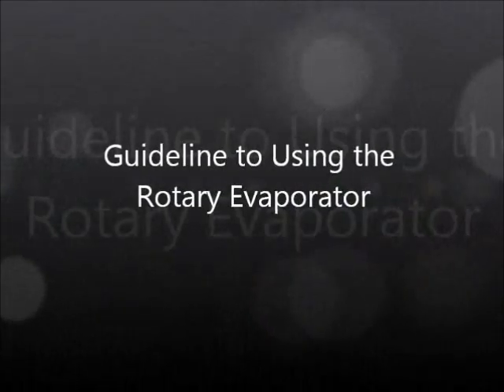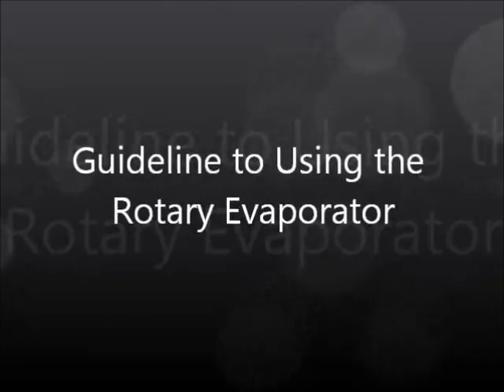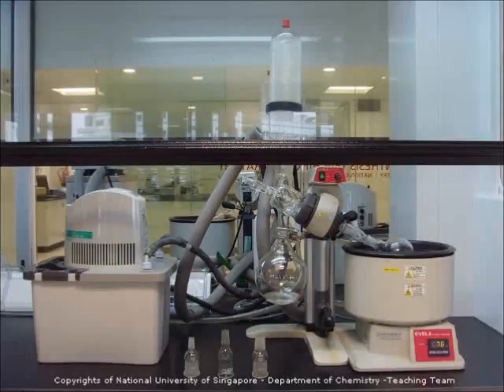This is a video to show you how to use the rotary evaporator in the laboratory. This is a rotary evaporator which we use to remove solvents at a lower temperature than they normally boil at. We do this by applying a reduced pressure in the system.